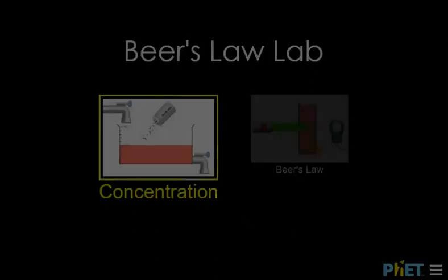This video will get you using the PhET Beer's Law Lab, which is a simulation of a spectrophotometer used in chemistry.